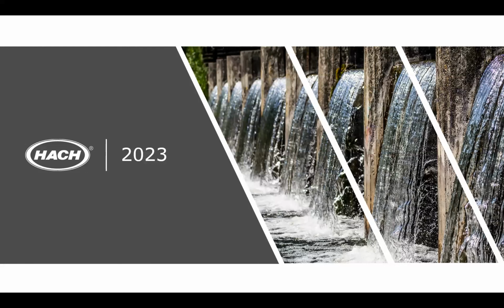Okay. And then a follow-up from the chat, it says, are there wearable parts or consumables that need to be replaced for this? Not a lot going on in a turbidimeter. The bulb itself is really the only thing that you need to be concerned about going forward, and that is just a matter of whether it has its original or sufficient intensity, or consistent light production.